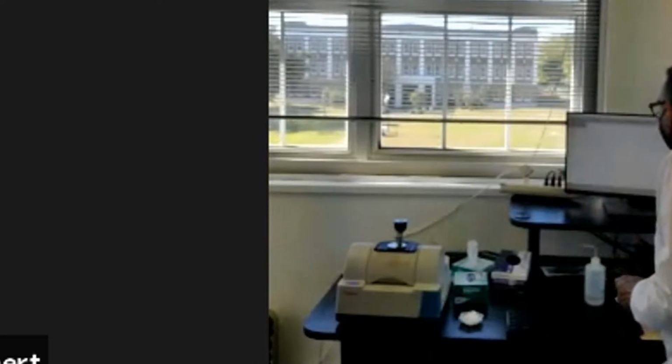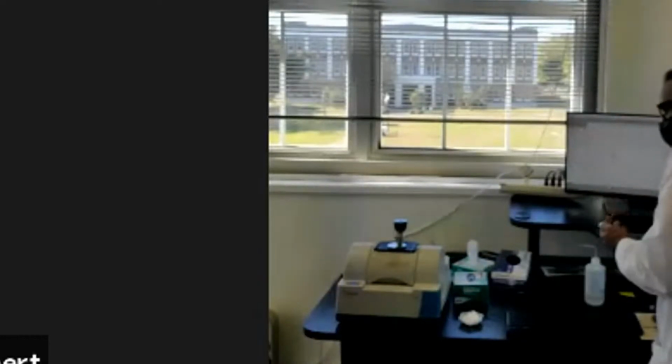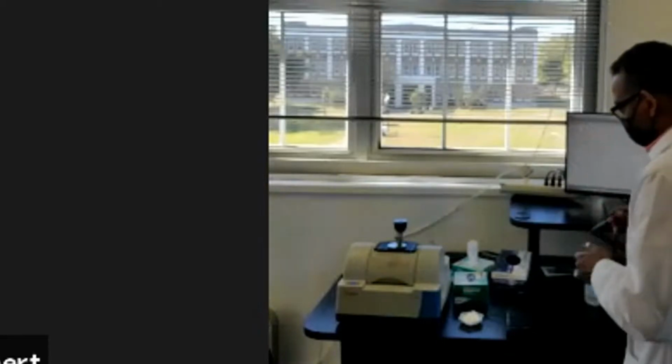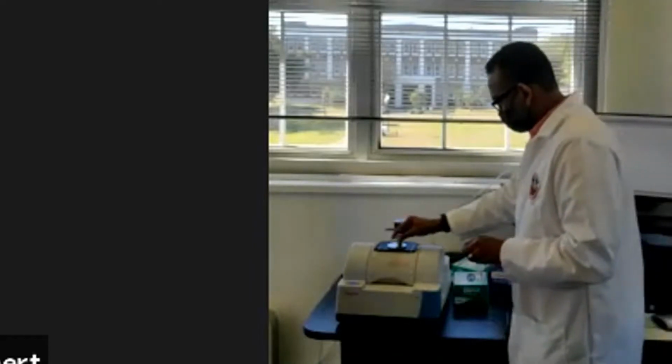Okay, I'm not going to add the background. You're asking me to add the background to the page. I don't want that. Again, the software is going to keep it and subtract it. So I say no. Now it's a matter of putting my sample. Use a micro spatula because you don't need a lot of sample. You just need literally milligrams. I'm going to switch this to the right. There is a small diamond window. That's where you need to take enough sample just to cover that diamond window.